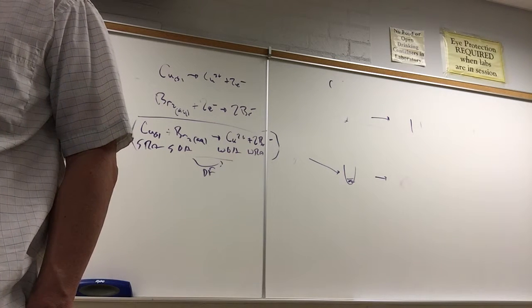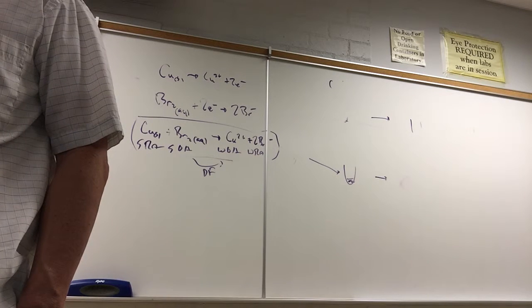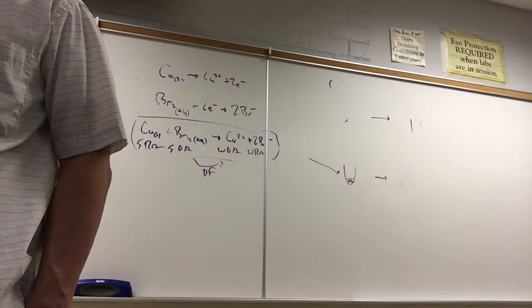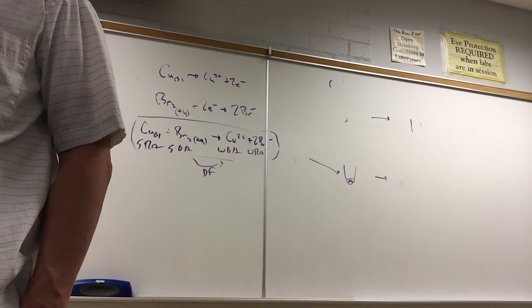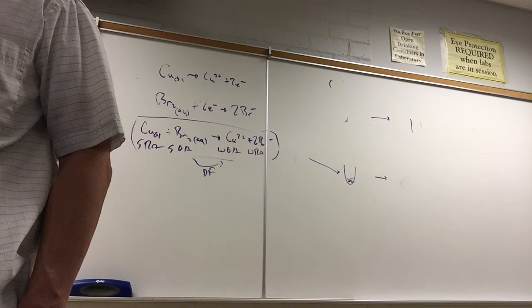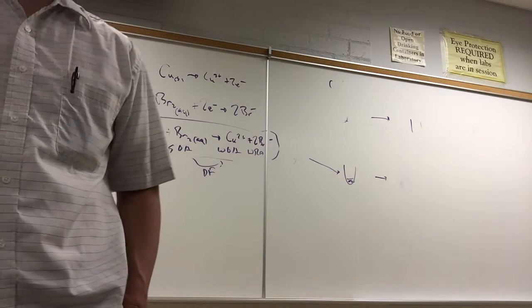You don't want to fall too far behind, because pretty soon I'm just going to cut it. But a full lab period for 15 reactions should be plenty of time. So try to get it done quickly now, and then start working on these 18. The 18s take more time than those 17s, okay?